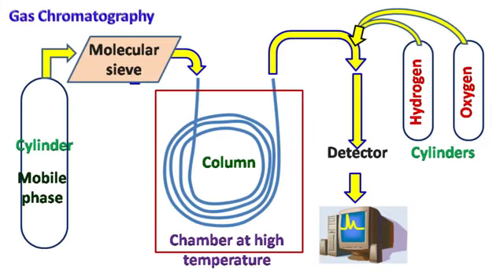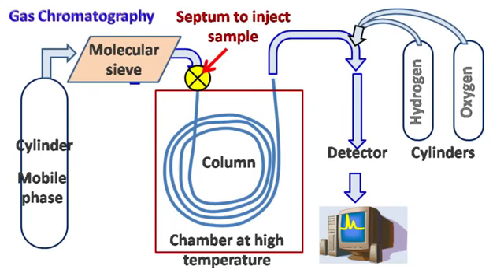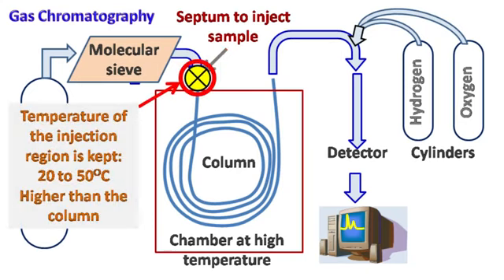Let's see the working of gas chromatography. The sample which is to be separated is mixed with an appropriate volatile solvent such as heptane, acetone or methanol. Just before the column, there is a septum that allows injection of the sample. The temperature of the injection region is kept 20 to 50 degrees Celsius higher than the column. This allows rapid volatilization of the sample. Once the sample is volatilized, it passes down the column where the separation occurs.